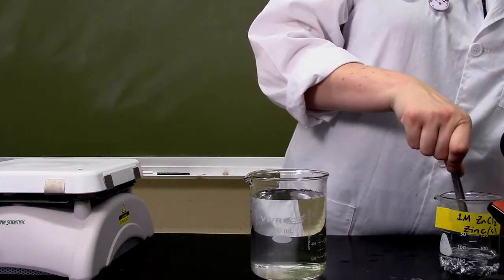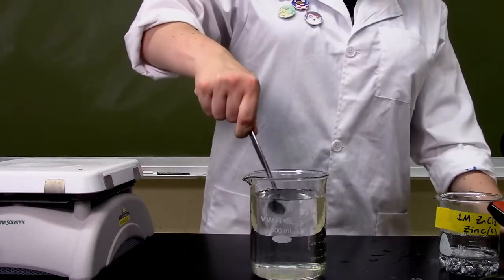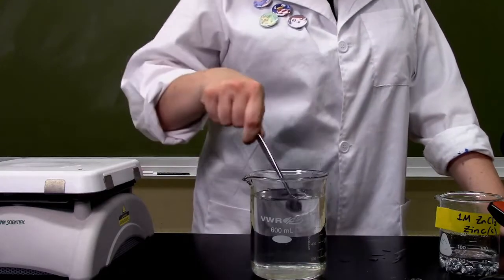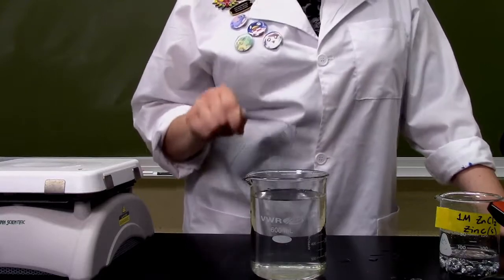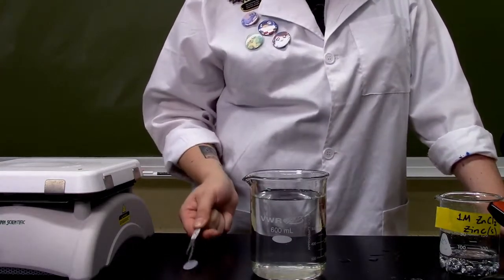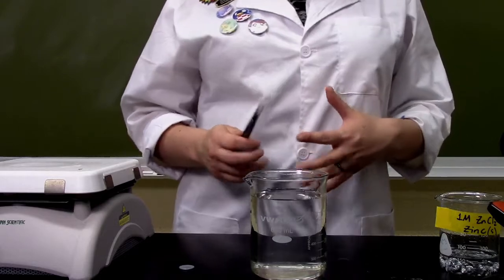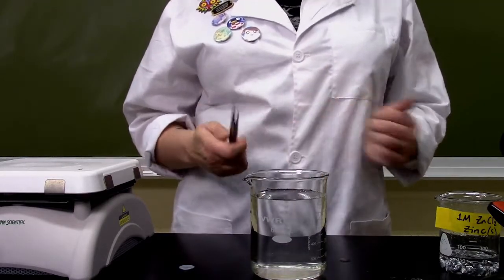Alrighty, so let's grab penny number 1 here. Let's dip it in. Okay, well that noise wasn't as loud. Depending upon how hot your pennies are, it may make that hissing noise as it cools down. All right, so I'm gonna set this down on the countertop, and I'm gonna be careful not to touch the zinc-coated penny with my hands. It can actually rub off if you rub too hard on the pennies.